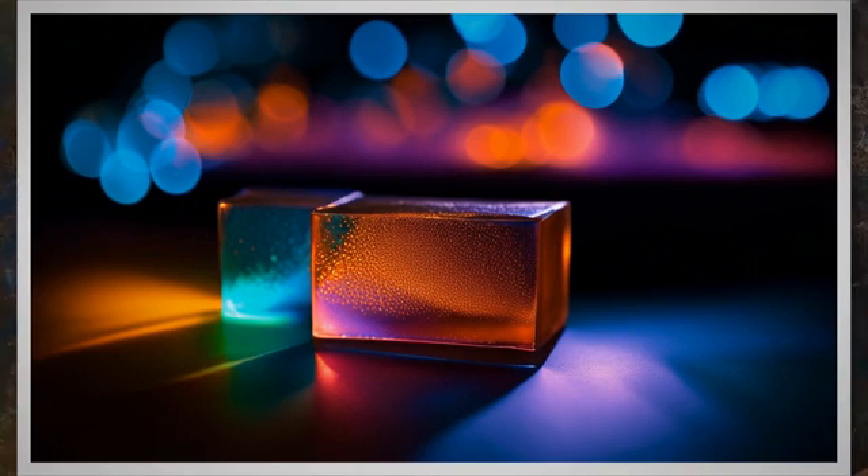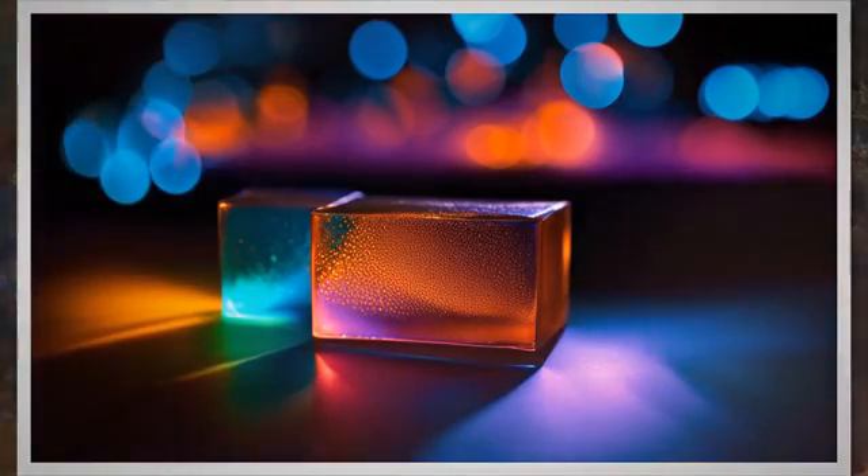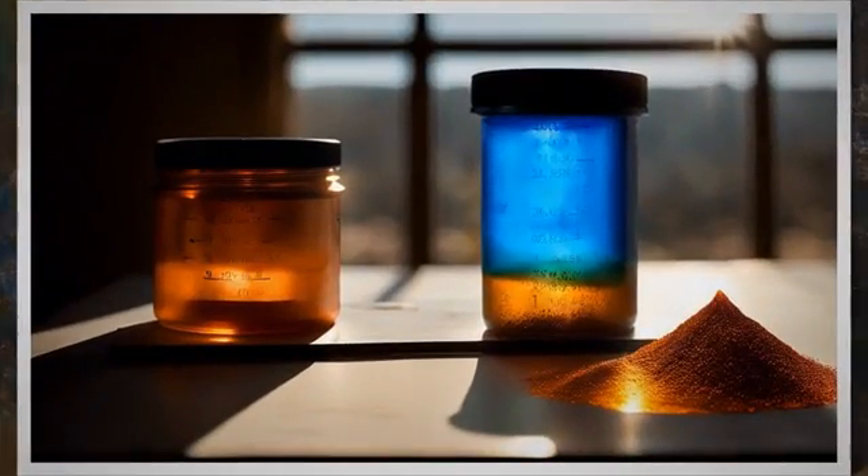The copper sulfate test for passivation parts is carried out by applying the copper sulfate solution following the steps described above. The ASTM copper sulfate test is specified in ASTM A380 standard.